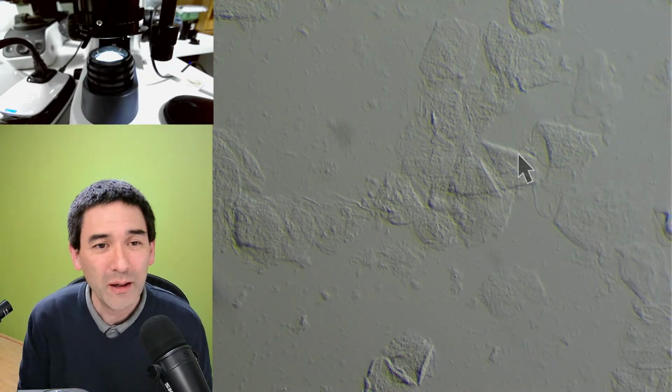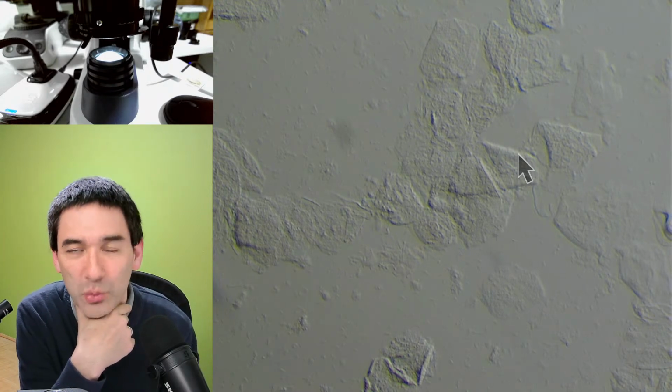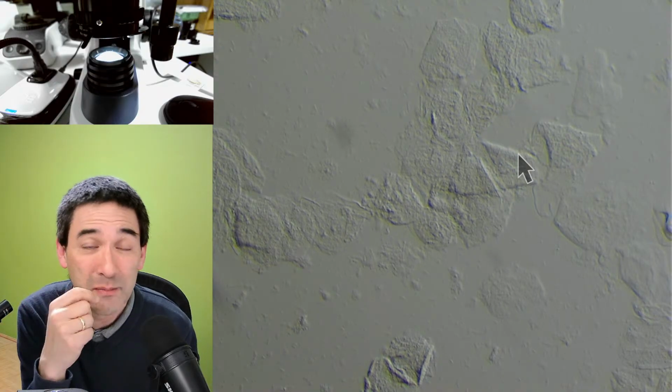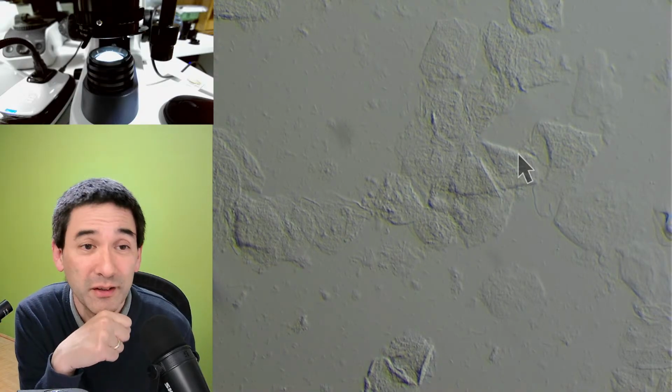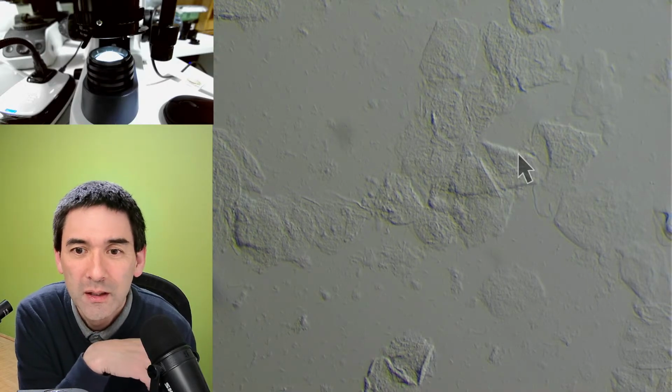However, the bottom line is again, not all specimens are equally suitable. I really have to say that. Some specimens really work nicely, and others they don't.